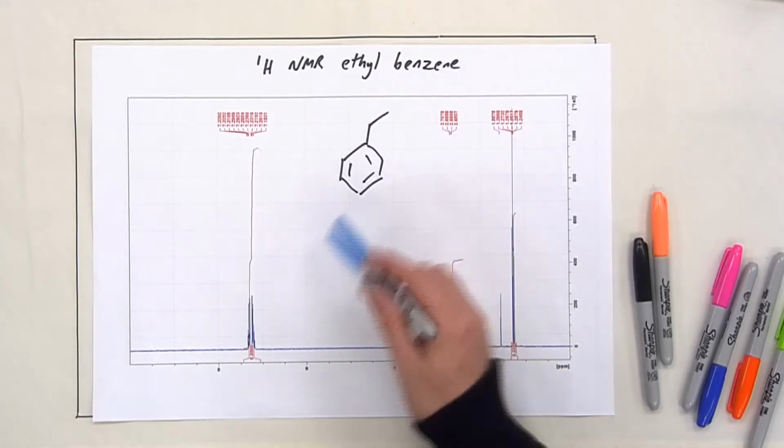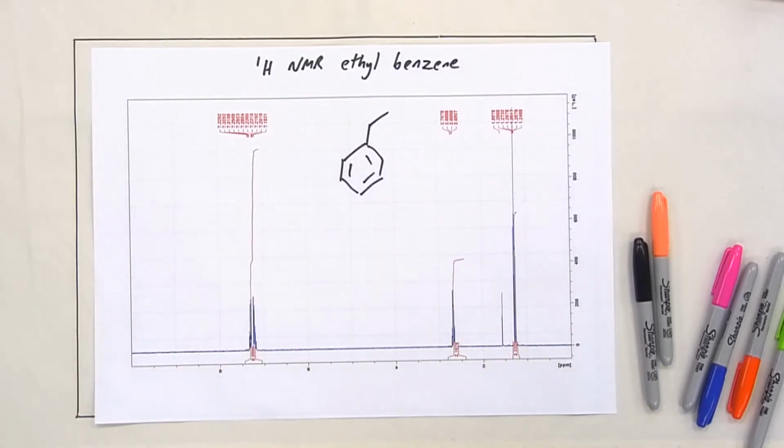So we're going to be moving now to the proton NMR. We want to have a look at the spectra, and then we've got another widget coming up in a minute about that. Okay, so I think one of the key things to note, so should we first of all have a look and work out how many different proton environments there are within ethyl benzene? Okay, it's slightly different to the carbon environments. All right. So we've got spectrum to begin with.